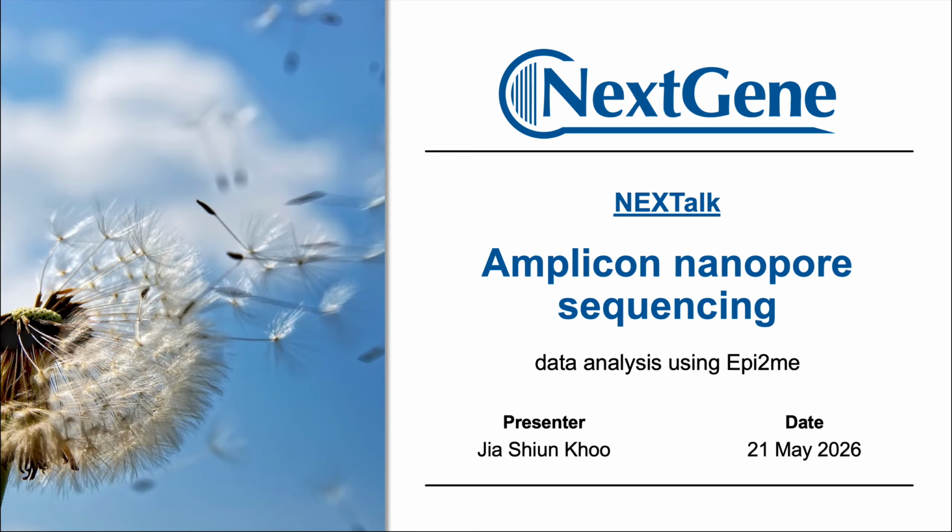The next question is from Sarah. For adaptive sampling on human samples, which workflows in EPI2ME should be used? I'm trying to get the question from the chat box.